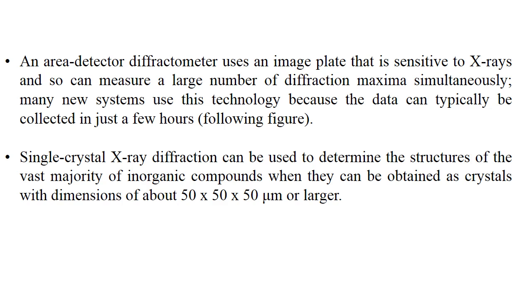Single crystal X-ray diffraction can be used to determine the structures of the vast majority of inorganic compounds when they can be obtained as crystals with dimensions of about 50 by 50 by 50 micrometers or larger.